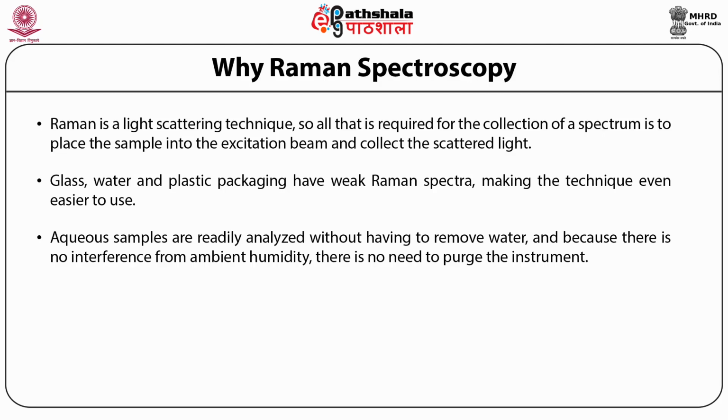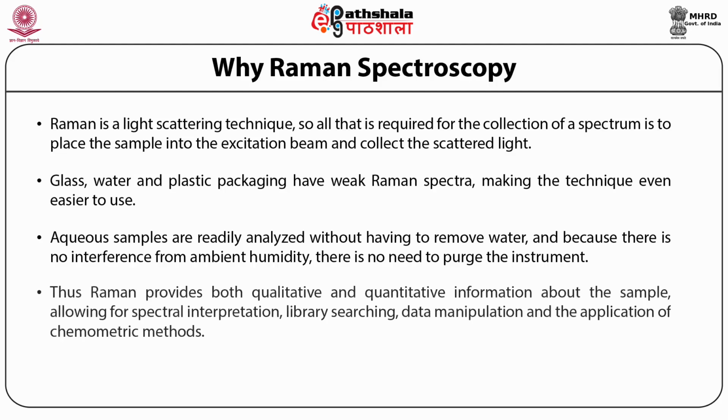Now, no two molecules give exactly the same Raman spectrum, and the intensity of the scattered light is proportional to the amount of material present. Thus, Raman provides both qualitative and quantitative information about the sample, allowing spectral interpretation, library searching, data manipulation, and the application of chemometric methods.